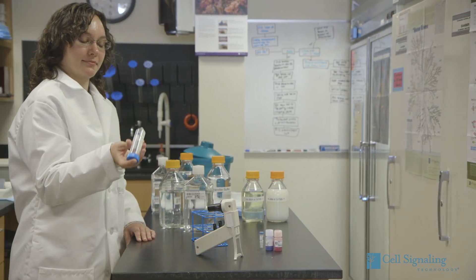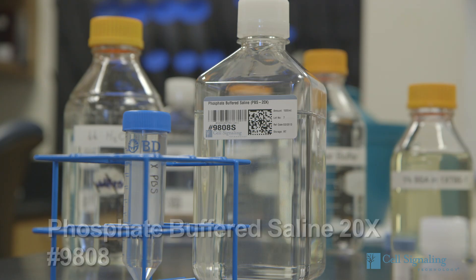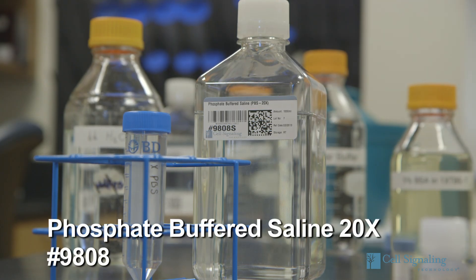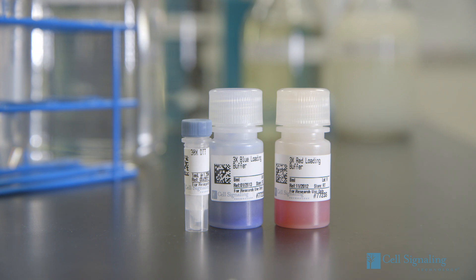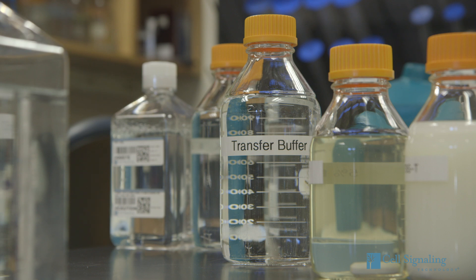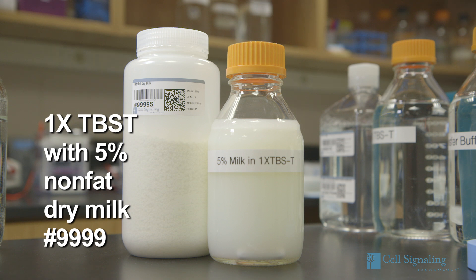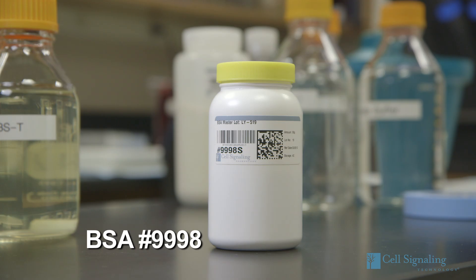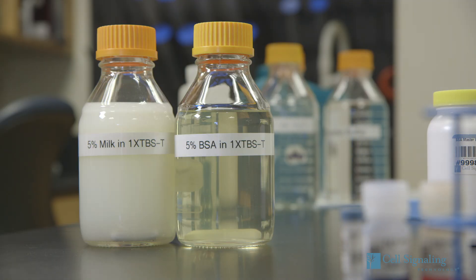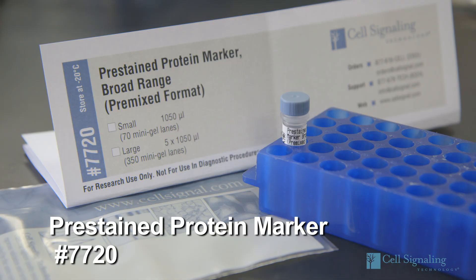Before you begin, you should have a number of solutions on hand. Directions to prepare these solutions can be found on the protocol page of our website. These reagents include 1x PBS prepared from 20x stock, 1x SDS sample buffer prepared using either CST Blue Loading Buffer Pack or Red Loading Buffer Pack. See the sample preparation section for alternate use of cell lysis buffer or RIPA buffer. Also needed are transfer buffer, 1x TBST prepared from 10x TBST stock, blocking buffer prepared from nonfat dry milk, bovine serum albumin or BSA, primary antibody dilution buffer containing either 5% BSA or 5% nonfat dry milk as indicated on the product datasheet, signal-fire ECL reagent, pre-stained protein marker, and a blotting membrane.